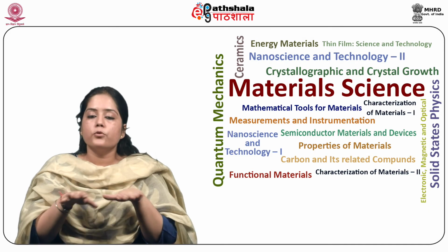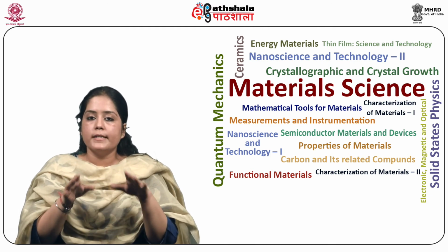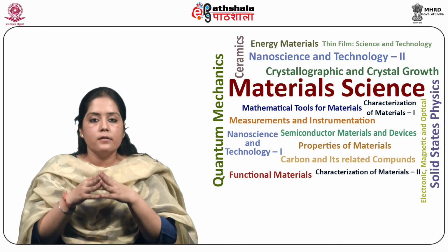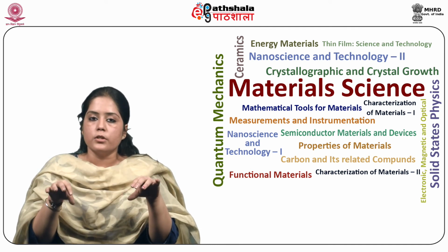The linear photodiode array is an example of a multi-channel photon detector. These detectors can simultaneously measure all the elements of a beam of dispersed radiation.